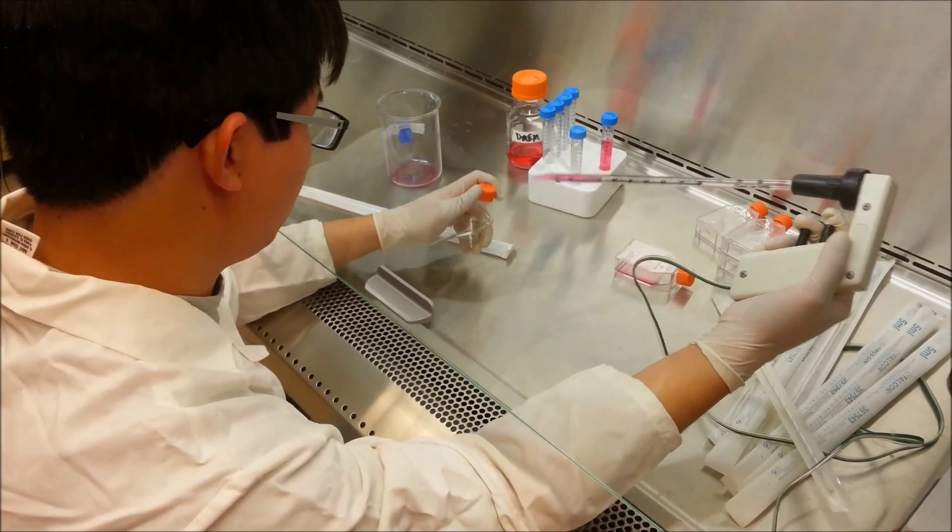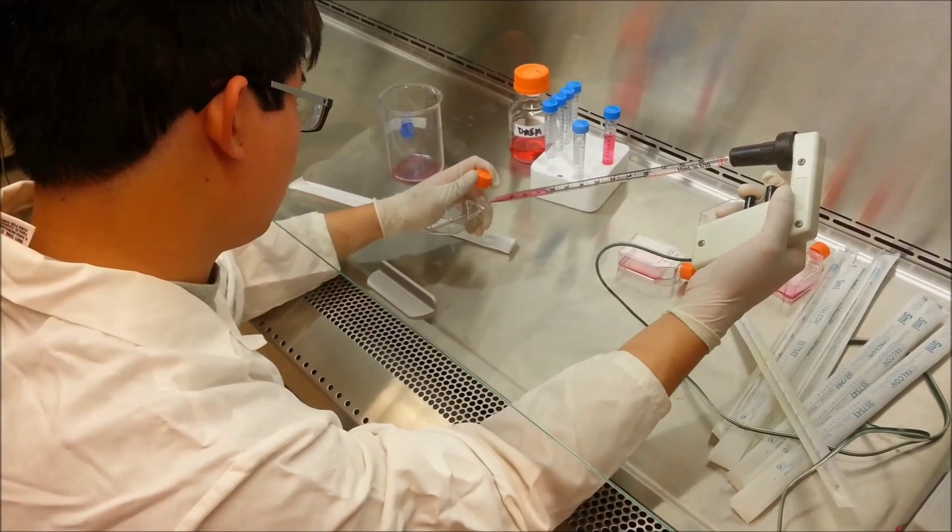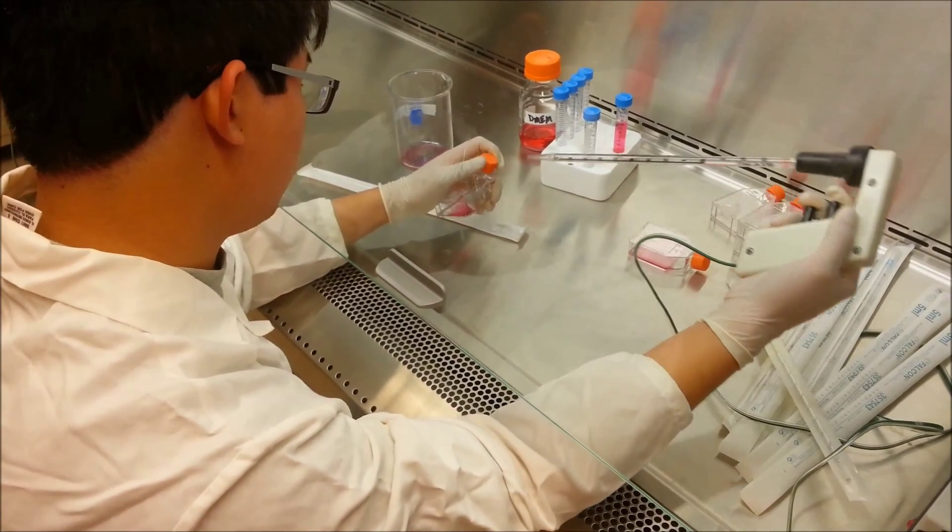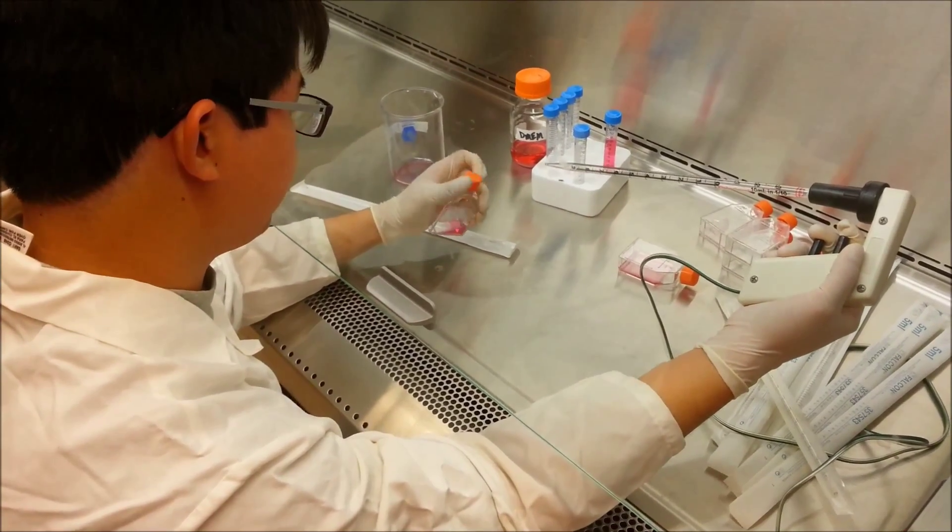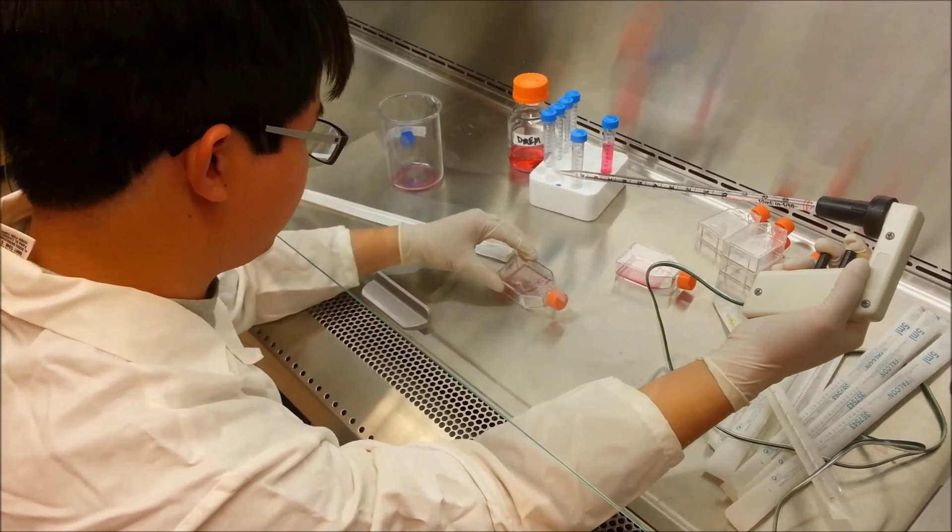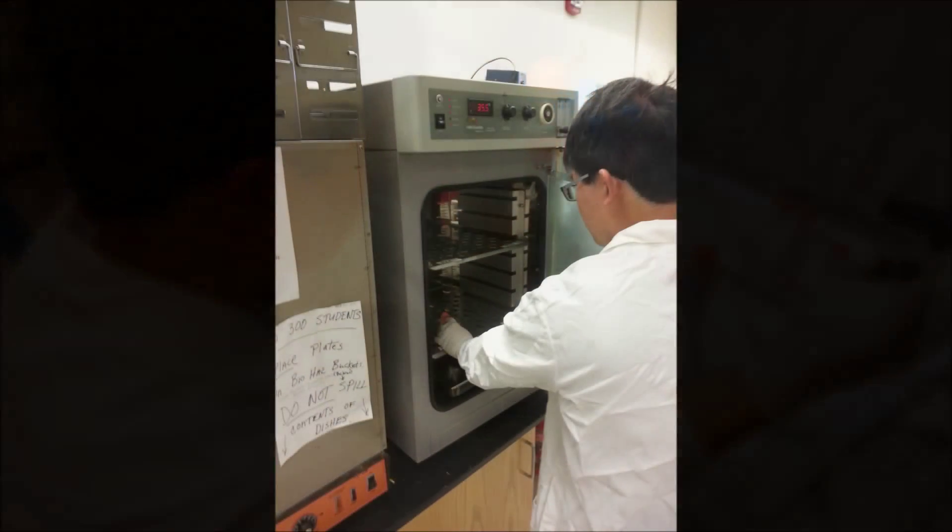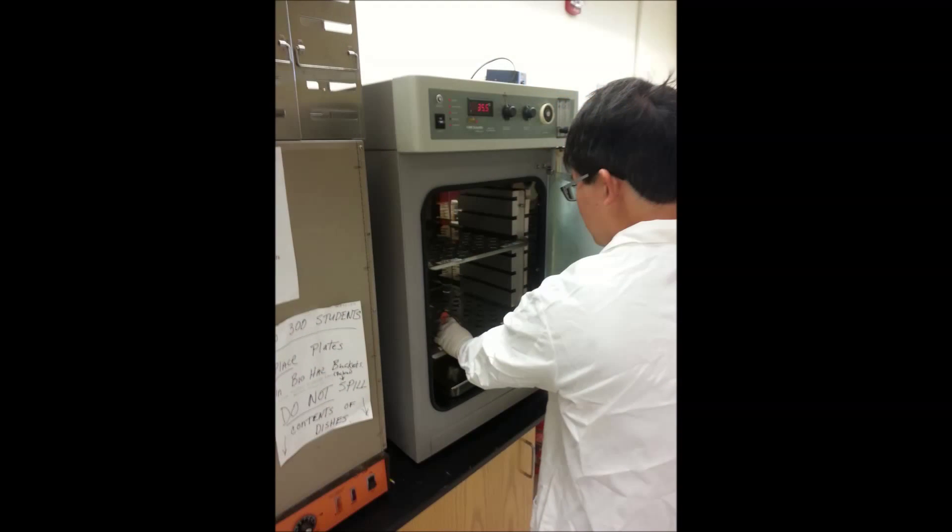Add about 3.5 mL of the new cell suspension to each of your T25 flasks, rocking them to ensure that the surface is completely covered. Place your cells in the incubator.